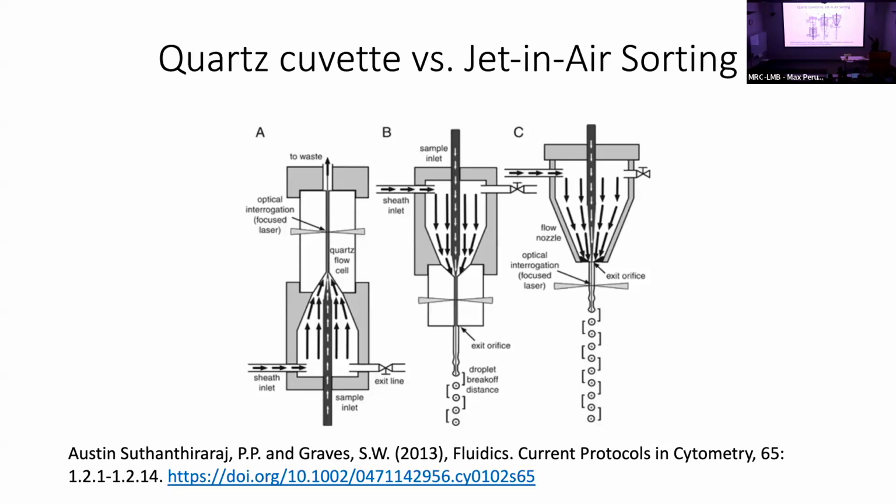Above these two cell sorters, we have a piezoelectric transducer that's vibrating at a really rapid rate. We can actually change the frequency of that transducer from quite low, say 10 kilohertz, all the way up to 90 kilohertz. And that means that we can essentially control the size of the drops. We also have different nozzles, I'll touch upon that in a second. But we can essentially control the frequency, so that's the speed of sorting.